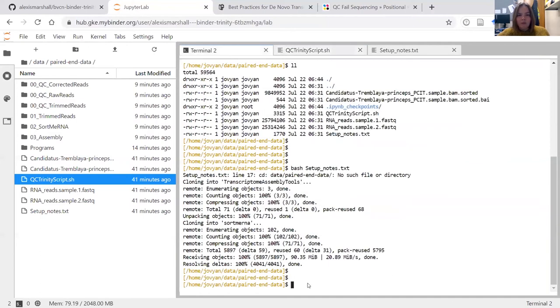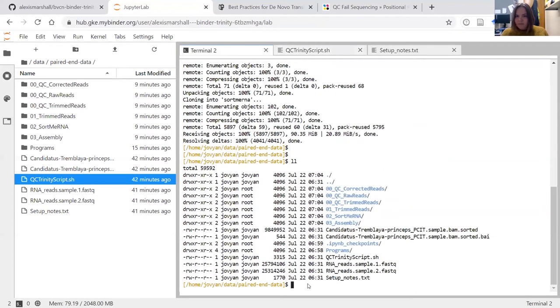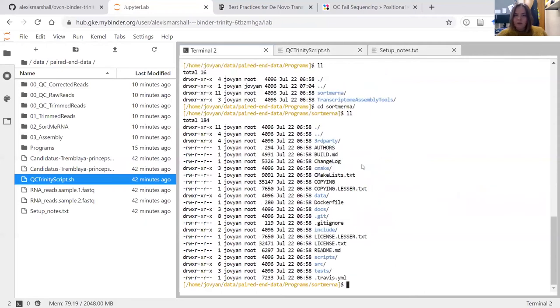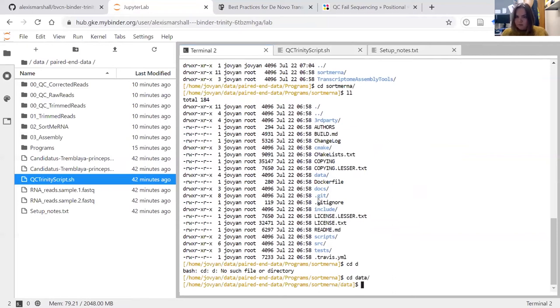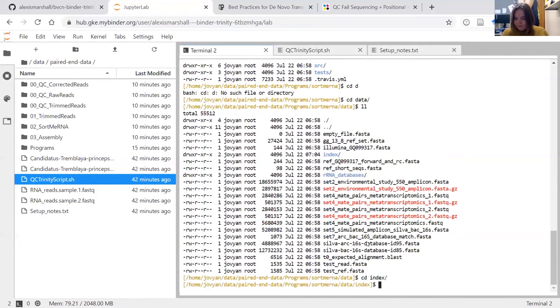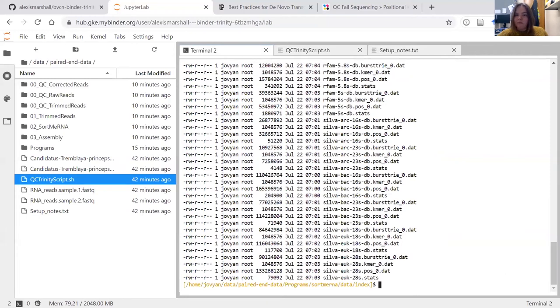Going back to the file browser, not only are all those folders created, but we have this 'programs' directory. Going in there, we can see the transcriptome assemblies tools folder has been downloaded from Git, and so has SortMeRNA. Moving into the SortMeRNA directory and then into the data folder, you can see there's this indexing directory we made and the ribosomal RNA databases directory that was downloaded. If we move into 'index', you'll see all of the indexes created as part of this step.